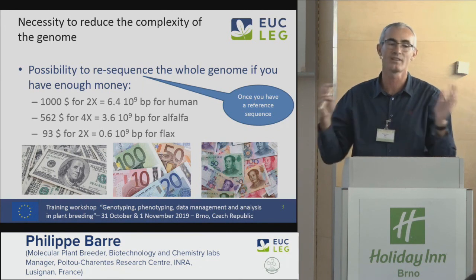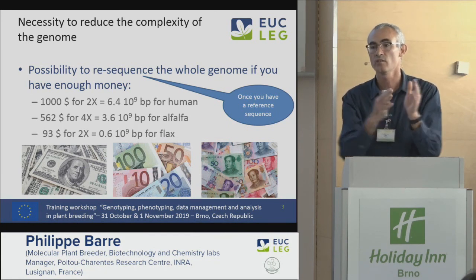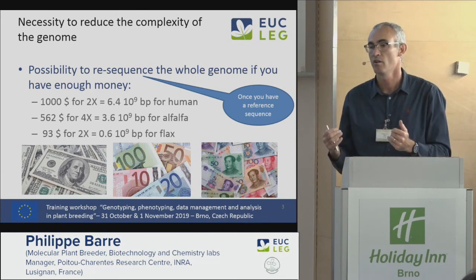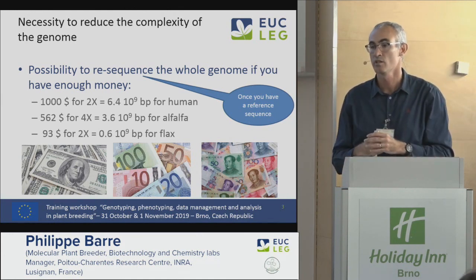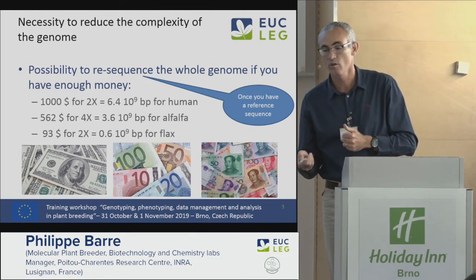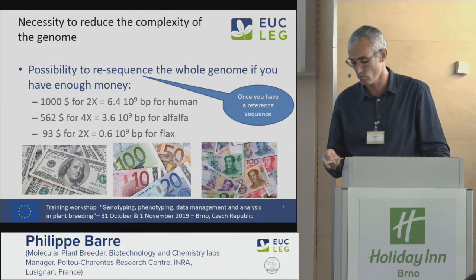For that, you need different techniques of sequencing. You need short sequences with good quality, and you need longer sequences with maybe less good quality, but that allow you to put together, to assemble the sequence. So here, when I say we can do the whole genome sequencing, I mean resequencing. And it's not the same price if you do it the first time.